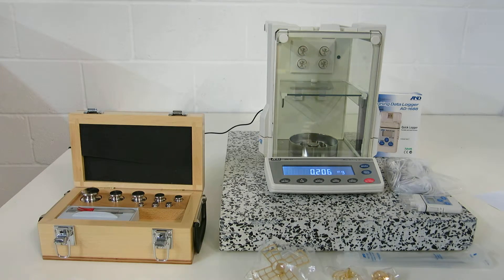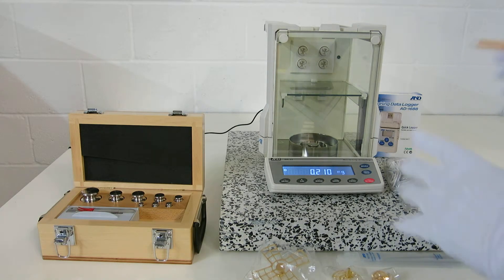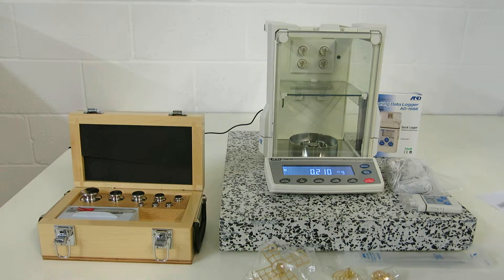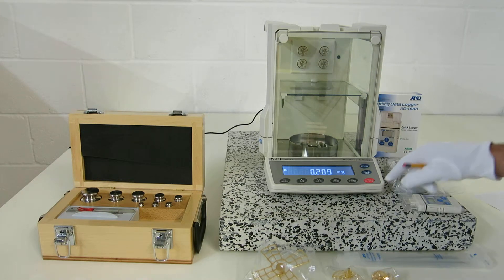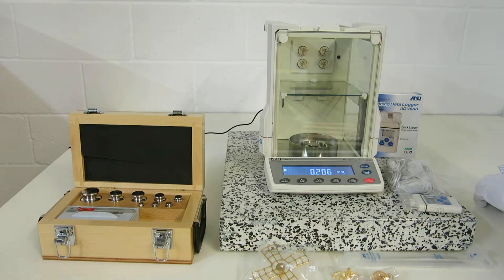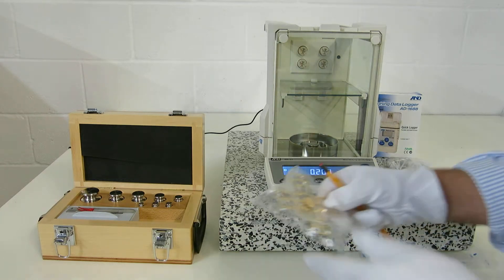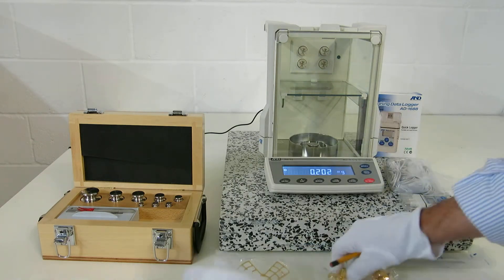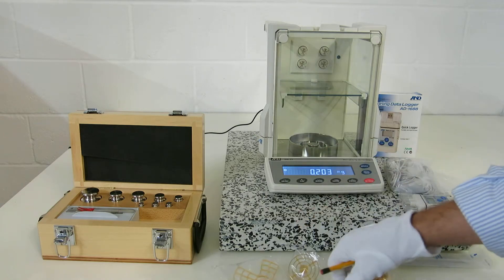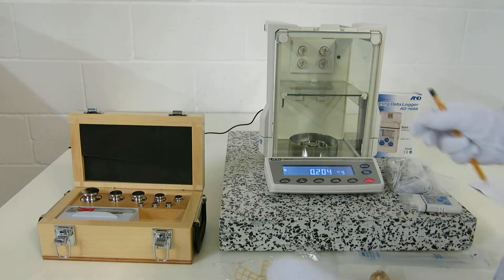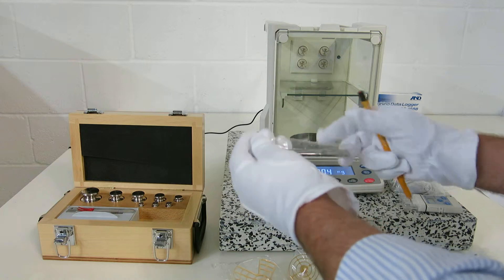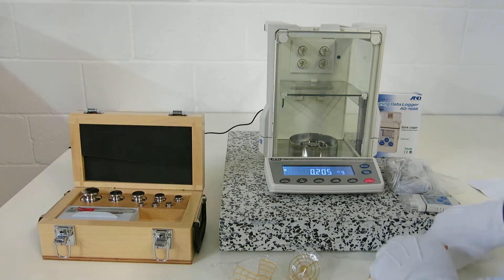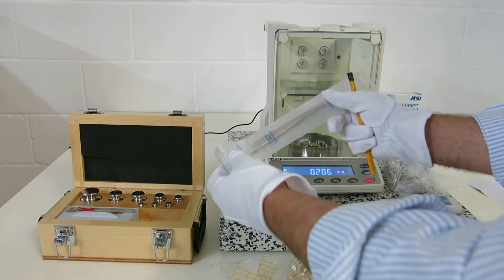So, quite a compact unit, very well made, as you'd expect from A&D. Let me tell you about some of the things that come in the pack here. We've got the filter weighing pan here, another small one here, we've got small aluminum weighing boats here, we've got some rather nice stainless steel tweezers, small and large here.